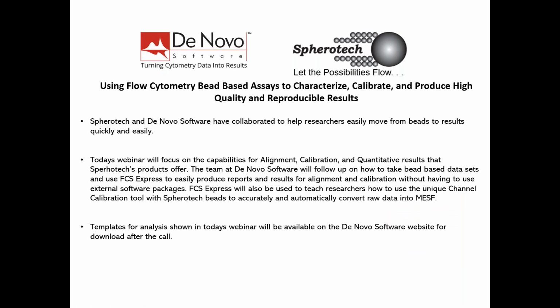So to get started on the webinar, the teams at Novo Software and Spherotech are really pleased to be working together today on this webinar. Essentially, we've started collaborating so that we can help researchers more easily move from their beads to results, by using the high quality beads from Spherotech and then the easy to use data analysis and reporting within FCS Express. So the first half of today's webinar is going to focus on the capabilities for alignment, calibration, and getting quantitative results from Spherotech's line of beads.